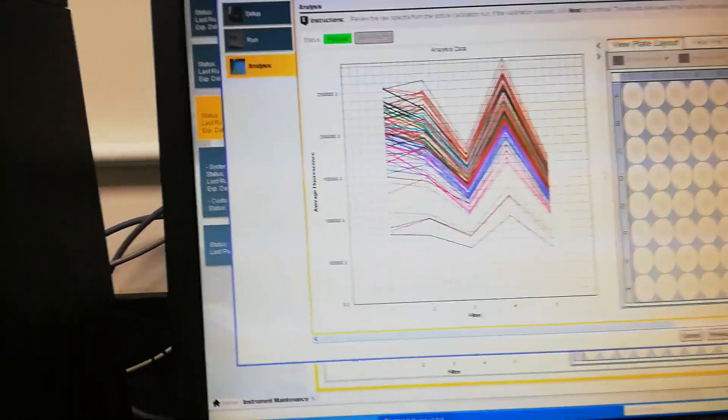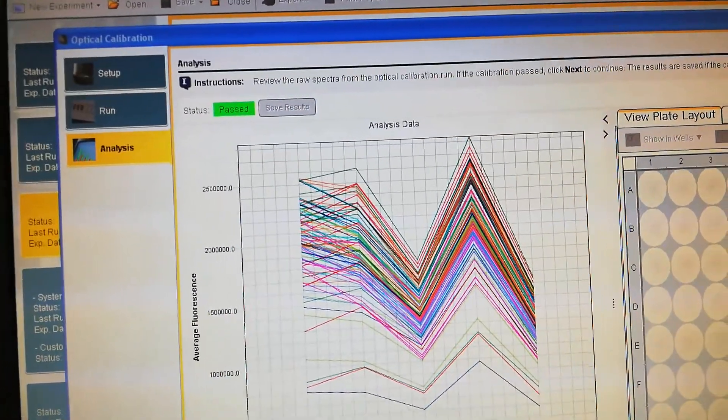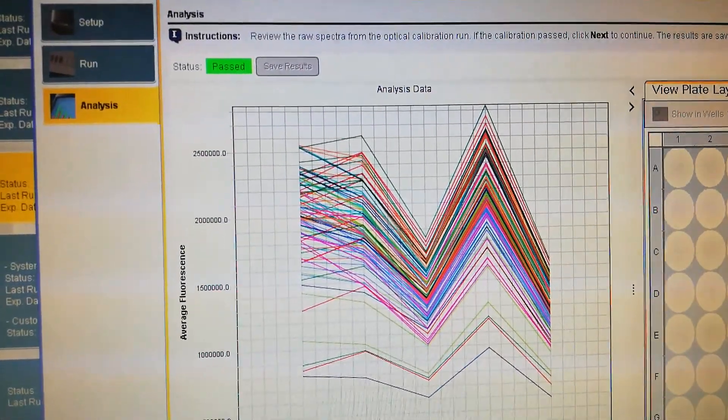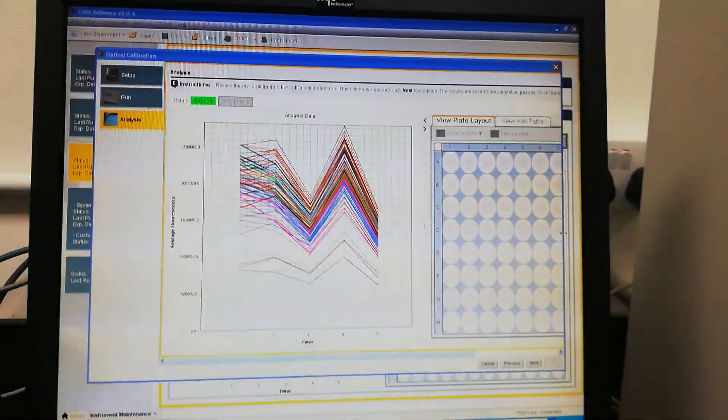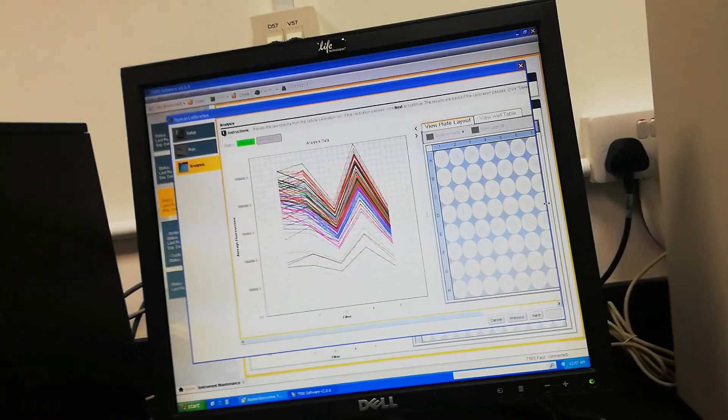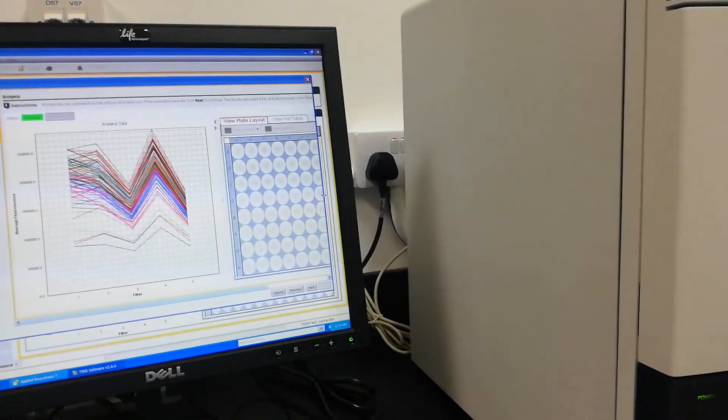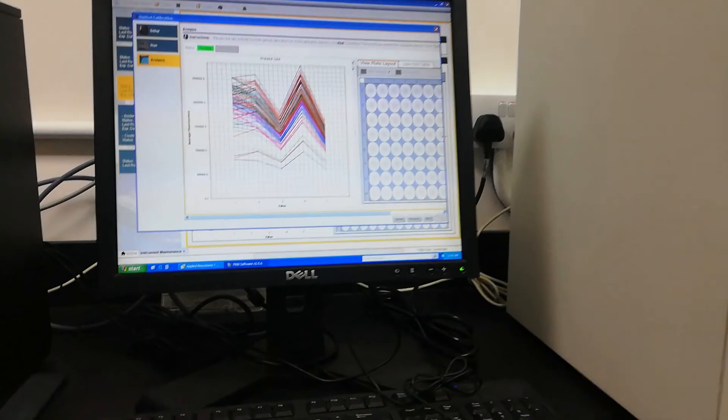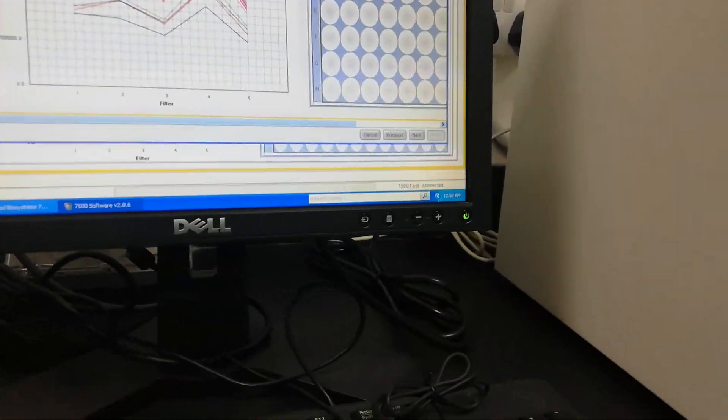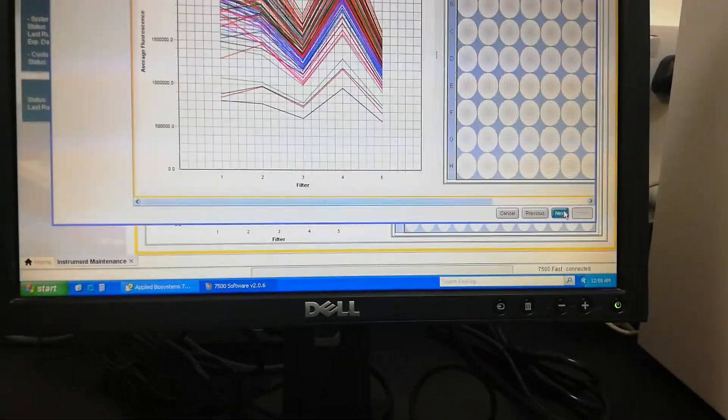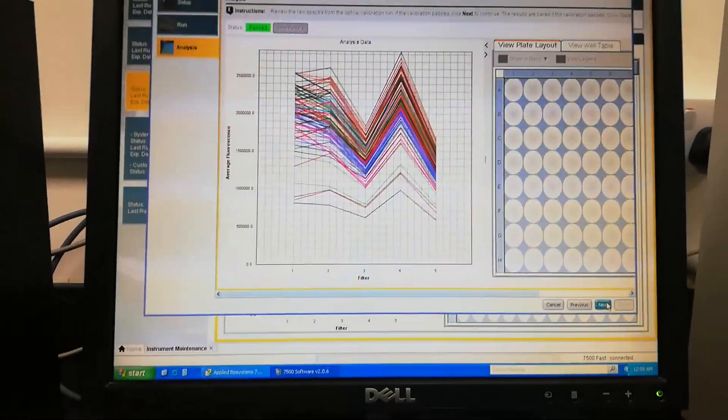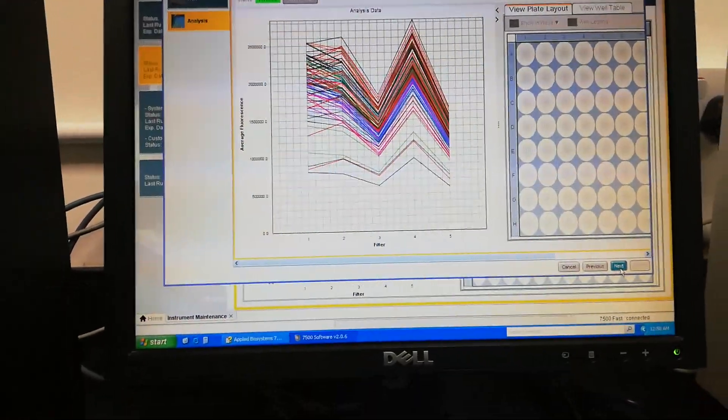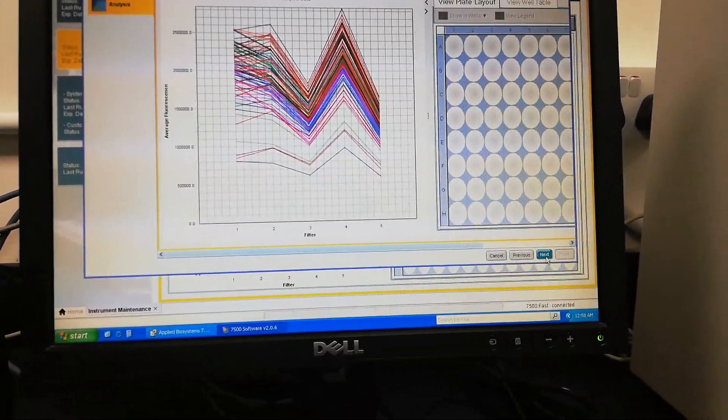Now it is showing that the optical calibration has also passed. This is the full lab. The optical calibration is passed now.